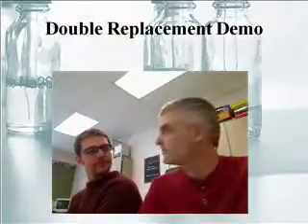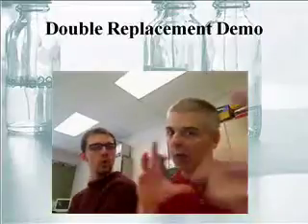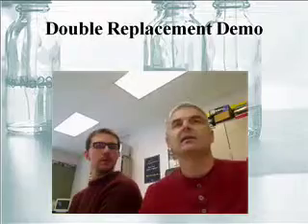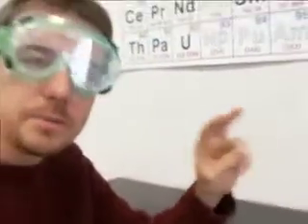All right. So I think we should do a demonstration. I think we probably should. So, Mr. Sams, you ready? I'm ready. Mix some chemicals and put them together. All right, now we want to show you a double replacement reaction. A double replacement reaction occurs between two ionic compounds that are in solution.